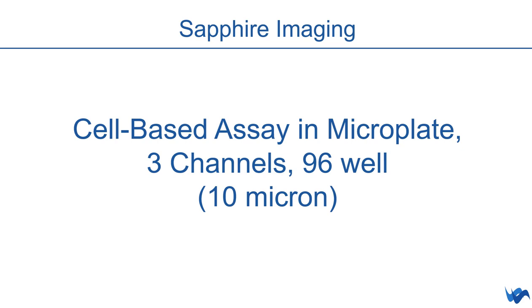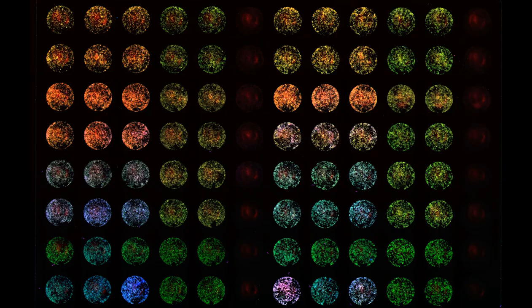So this cell-based assay, we recorded this with 3 channels in a 96 well plate. And the resolution we used for scanning is the highest resolution, the 10 micron. So let me show you this. 3 channels, you can see here, and very high resolution. And you can imagine when you zoom in here, you will see also a lot of details.